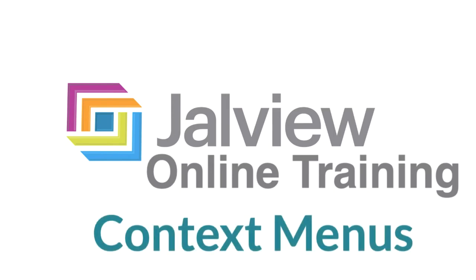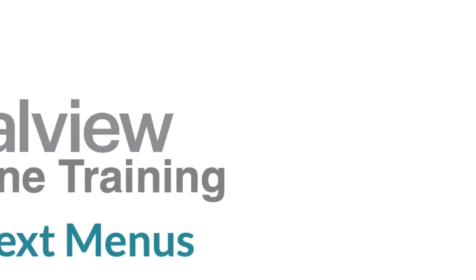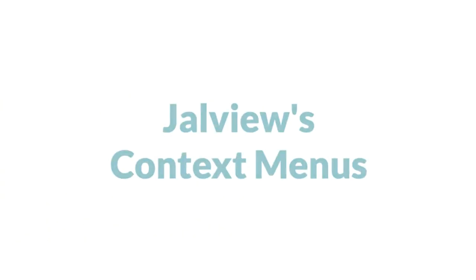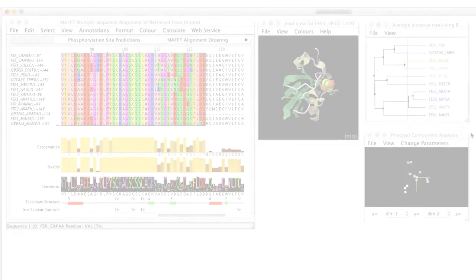In this Jalview online training video I will be looking at different menu options available in Jalview. Jalview has a number of context menus that are not immediately visible.